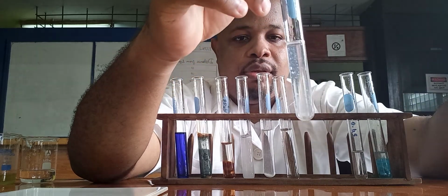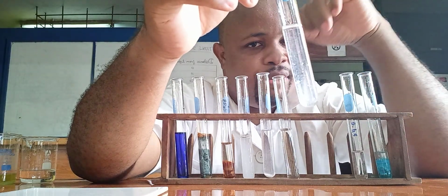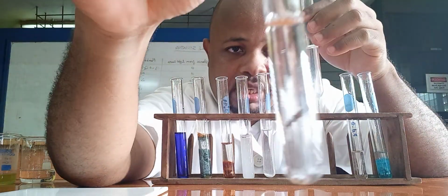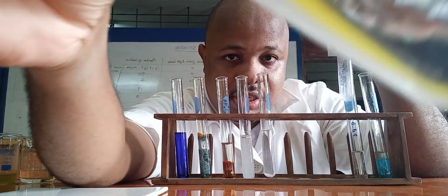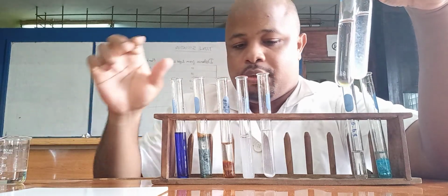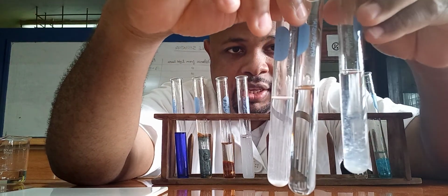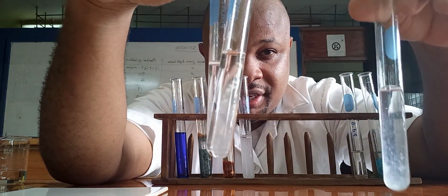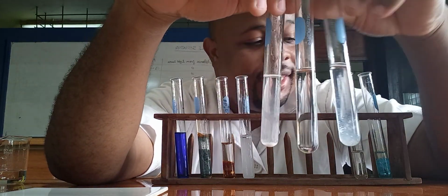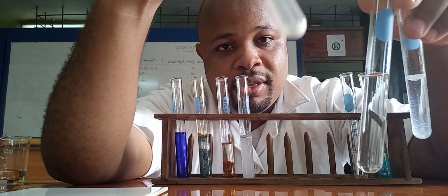Alright. So you can still see we have the precipitate there. So looking at the zinc, colorless solution. So let's compare them, right? So this is lead, this is zinc, and this over here is, sorry, this is aluminum, this is zinc in the middle, and lead.